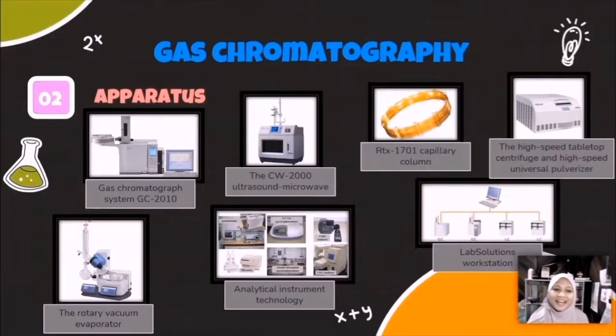Second, the apparatus. We will use the gas chromatography system GC 2010, the rotary vacuum evaporator, the CW 2000 ultrasound microwave, analytical instrument technology, RTX 1701 capillary column, the high-speed table-top centrifuge and high-speed universal pulverizer, and LabSolution workstation.